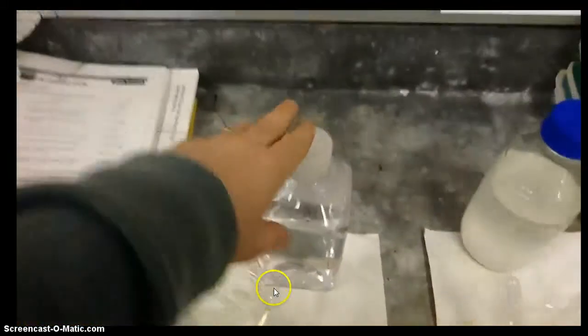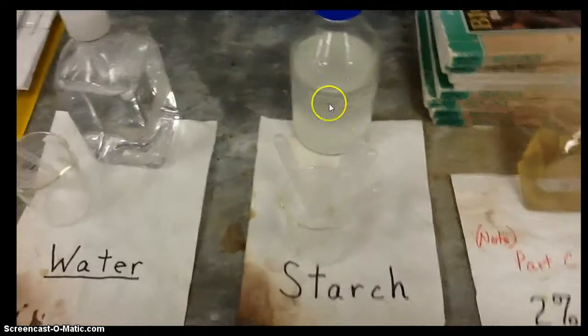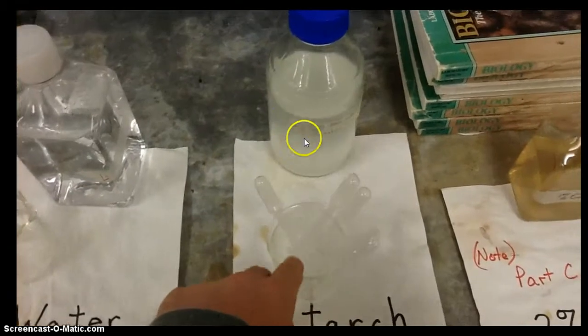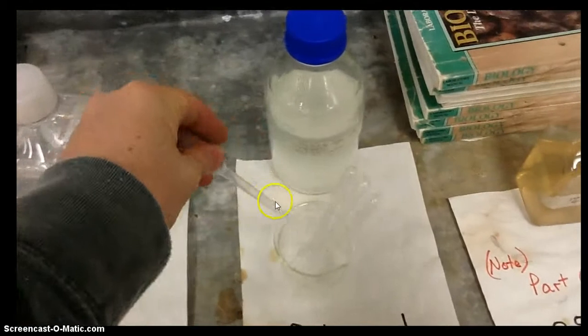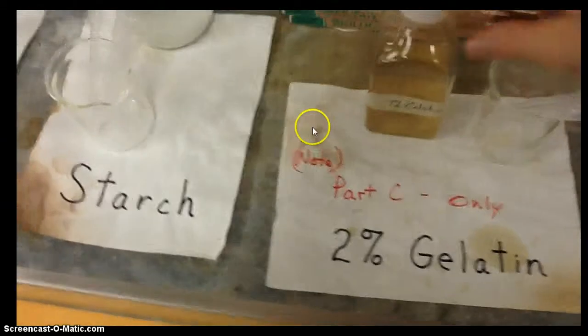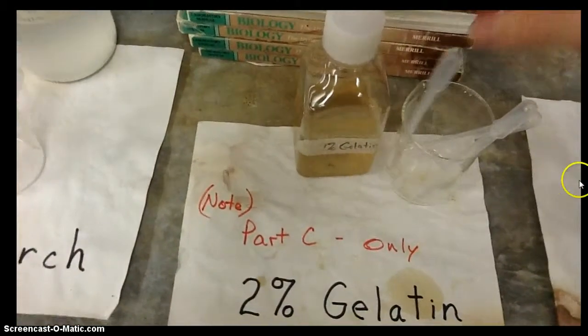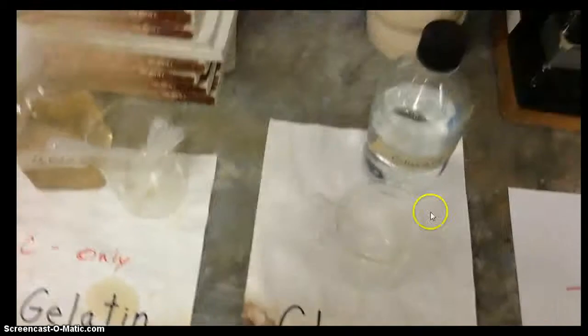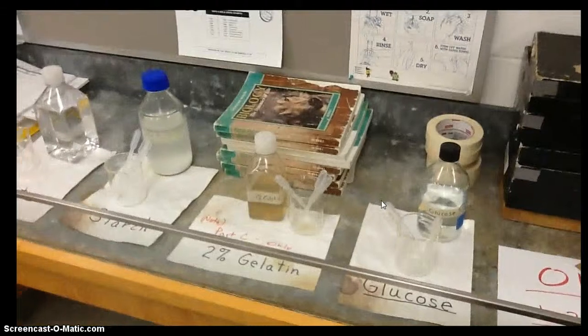Now, we're going to be first testing with water. Reason we're testing with water is, again, because it's a control. Starch here, make sure you mix the solution up, pour it into the beaker, and take just one eyedropper full of the material. Move your way on over to the gelatin. In the gelatin, shake it up, pour it in there, one eyedropper full in your test tube. And then over on the other side, we have glucose. Same thing, one eyedropper full is all you need. And then when you do your oil test, there's 3 drops of oil.